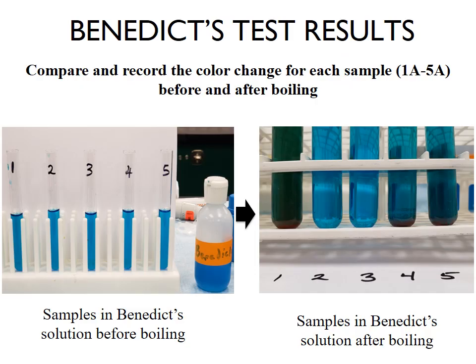So lastly, for the carbohydrate digestion test, we use the Benedict's test with Benedict's solution. And this is the Benedict solution, and you did well from the protocol. And after boiling, this was before boiling, and after boiling, you see the precipitation that is formed around here. And the amount of precipitation or the color of the solution gives you the degree of the reducing sugar that is present in your sample.